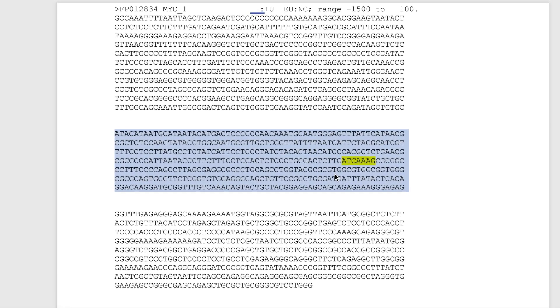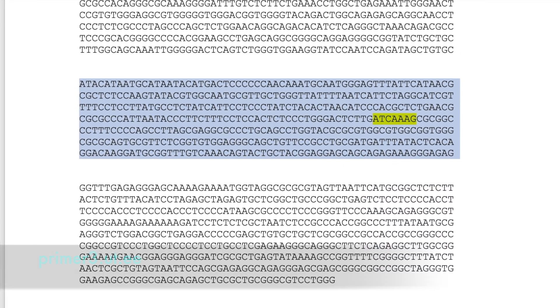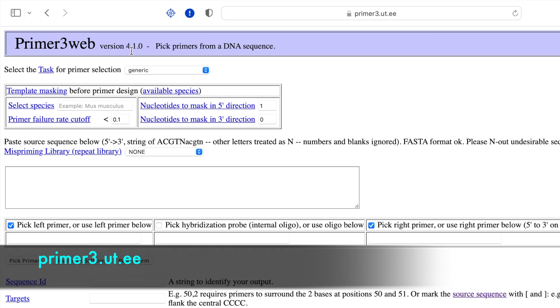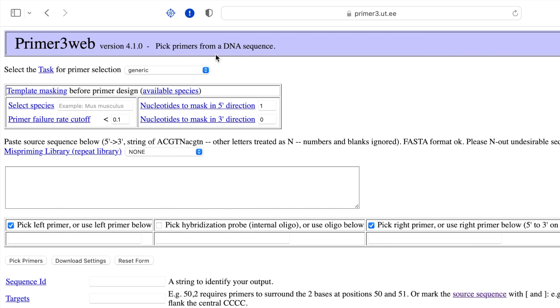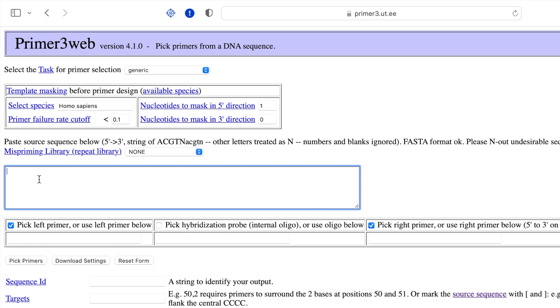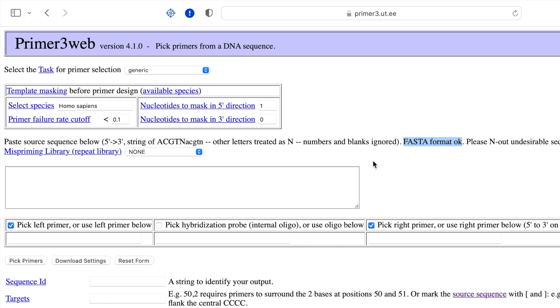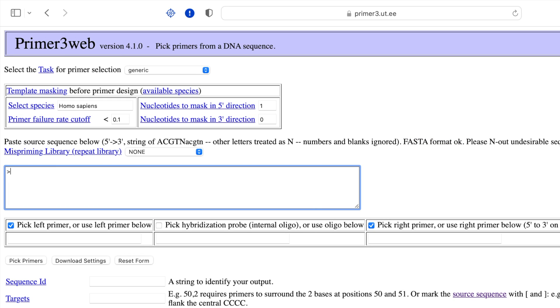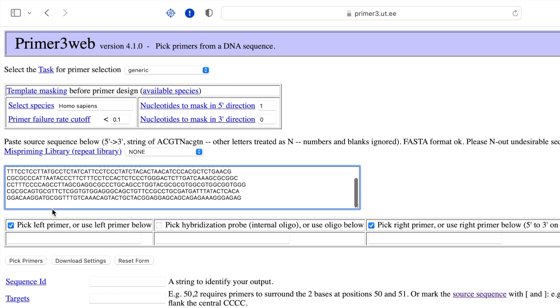Copy the selected sequence and head to the Primer3 website. This website is a tool to design primers from a DNA sequence. Keep the task for primer selection as generic. This website shows a template masking option for the primer design. Select the species as Homo sapiens and leave the other options in default mode. In the input box, paste the DNA promoter sequence that was copied earlier. The command input requires a FASTA format — paste the promoter sequence on the second line.